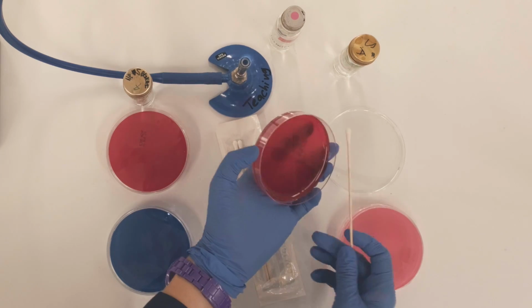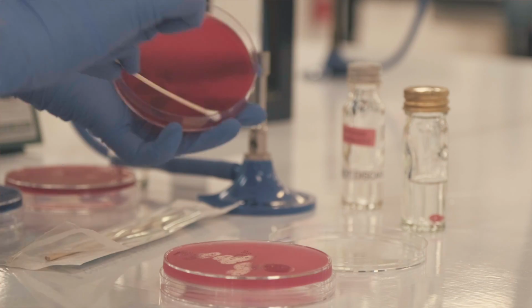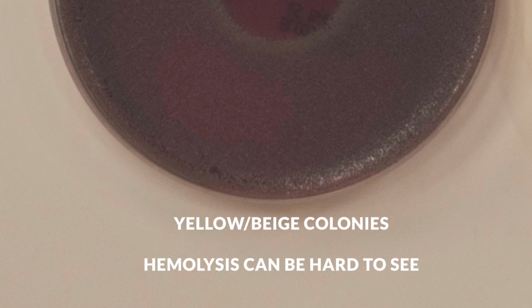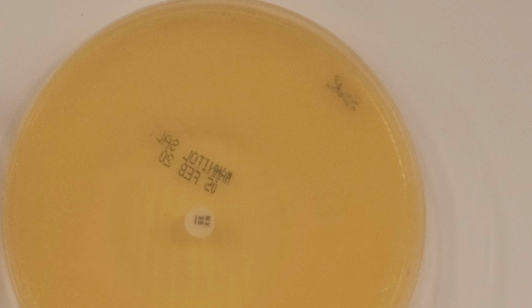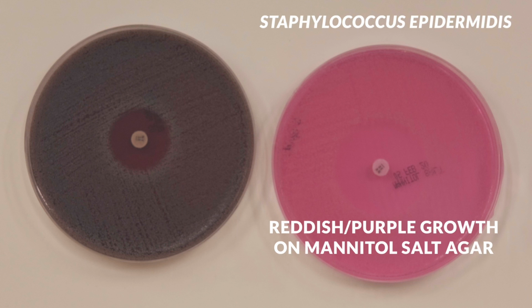Blood agar is a non-selective, general-purpose medium that supports the growth of most bacterial pathogens. The presence of blood provides some form of differentiation, as specific microbes can lyse the blood and lead to hemolytic zones of clearing. Typical colonies of Staph aureus on blood agar are yellow and often hemolytic. Mannitol salt agar has a high salt concentration, which selects for Staph aureus by producing colonies surrounded by a bright yellow zone. Other Staph species are surrounded by a reddish-purple zone on this agar.